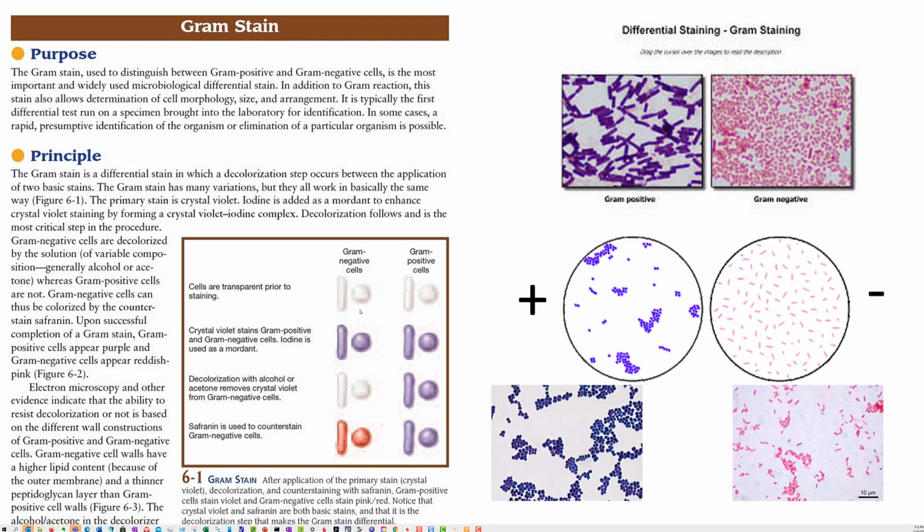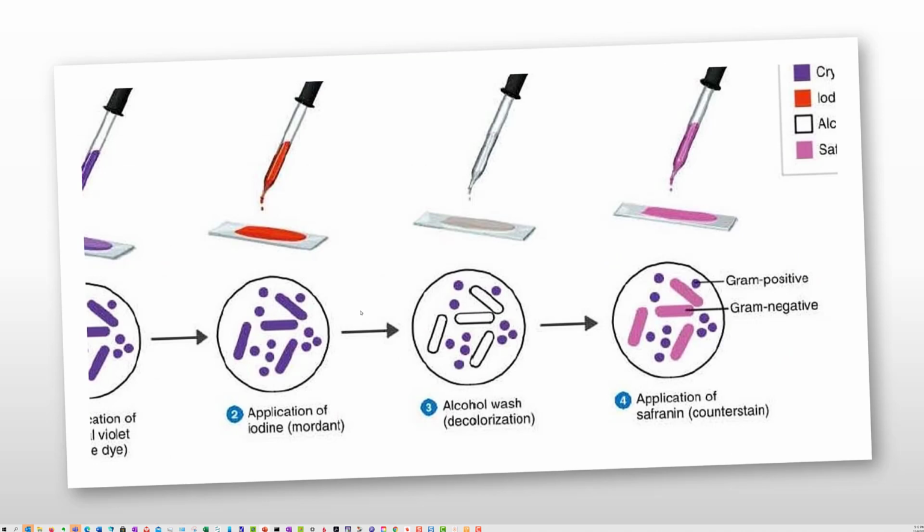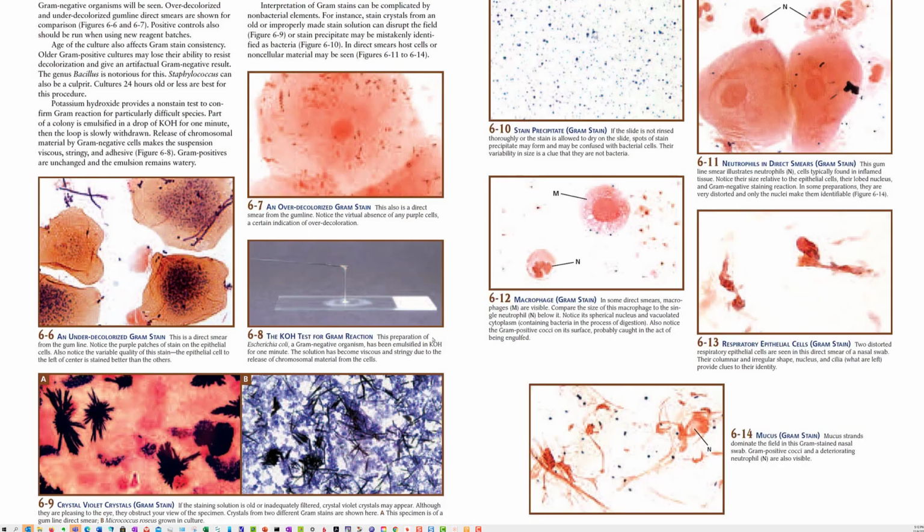Again, I'm not going to review the gram stain in total. Just know that we have certain procedures and certain things happen as a result of the timing of which we put the chemicals onto the slide. And then obviously you can have good gram stains and poor gram stains, and you want to just follow the procedures and you'll get that. The crystal violet does go bad, and you'll start to see crystals form like that, and I would just throw it away and get some fresh.